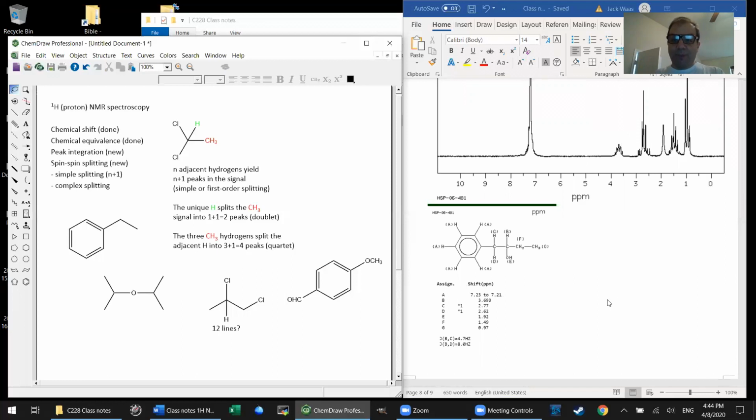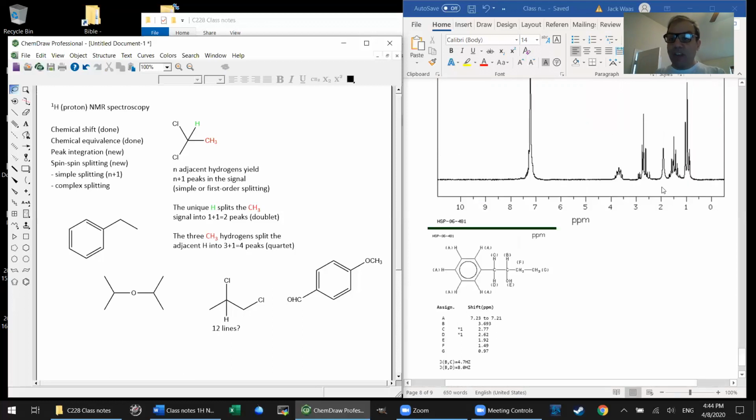And the problem here is the CH2, these F hydrogens, or you could also really find it on these hydrogens that are marked C and D. Even though they're on the same carbon, at any given time, one of those hydrogens is going to be closer in space to this OH group than the other one. And so these 2 protons are not the same. They're chemically different. And you will see if you look here that they actually have different chemical shifts.